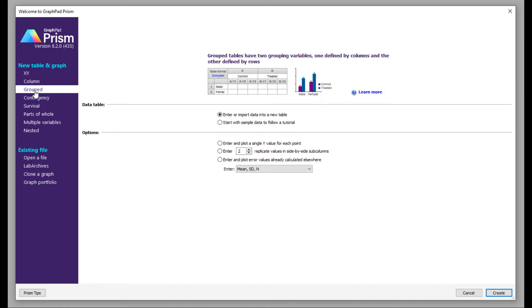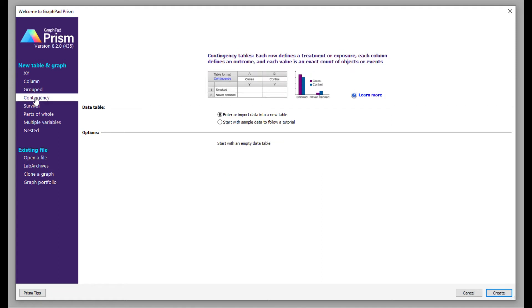Then you have contingency. In contingency, each row defines a treatment or exposure, each column defines an outcome, and each value is an exact count of objects or events. If you have contingency data, you can use this setting.